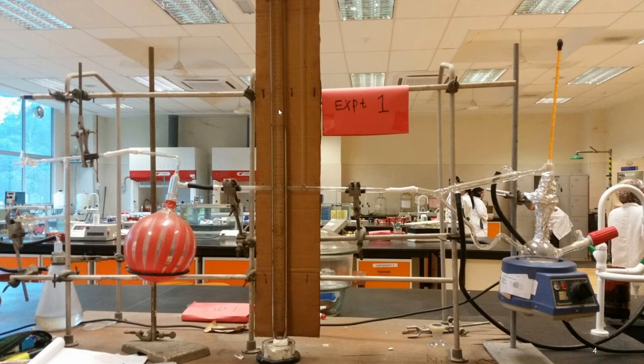So how do you lower the pressure? The easiest concept to remember is: the more air space in here, the higher the pressure. To lower the pressure of the system, you need to raise this mercury level up, so that you only have a short distance of air in here.